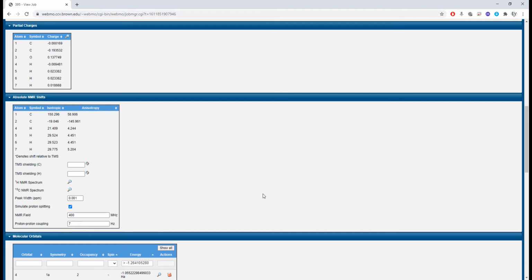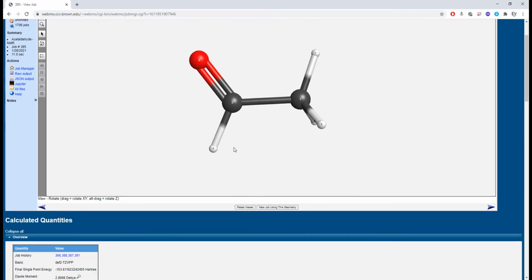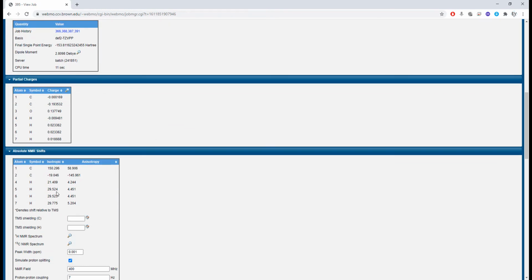And so, considering we're looking at a methyl group and the aldehyde, you would expect the methyl group probably somewhere in the 1 to 2 ppm region. This aldehyde probably in the 8 to 11, depending on everything else in those cases. So these are kind of off, and that has to do with the fact that NMR spectra are also referenced to a reference compound. When we're talking about any of those shifts, we're actually referencing it to tetramethylsilane, TMS for short. That's what we always set all of our NMR spectra to as 0.